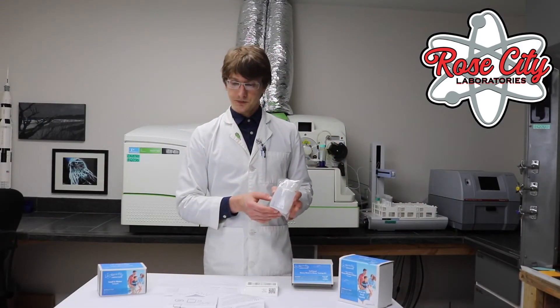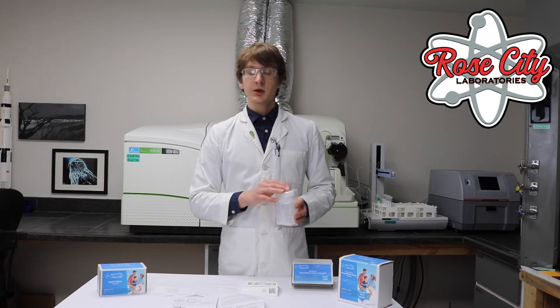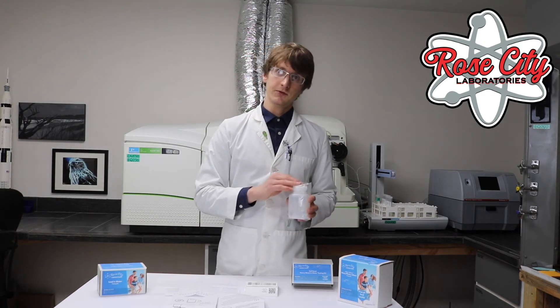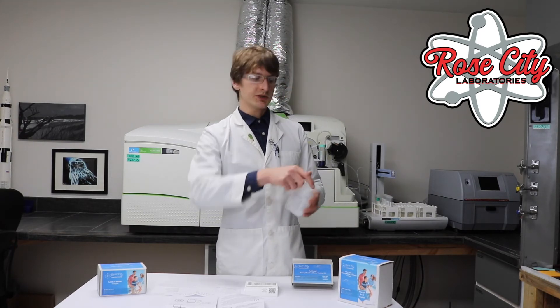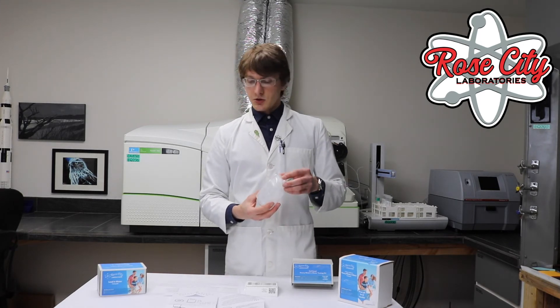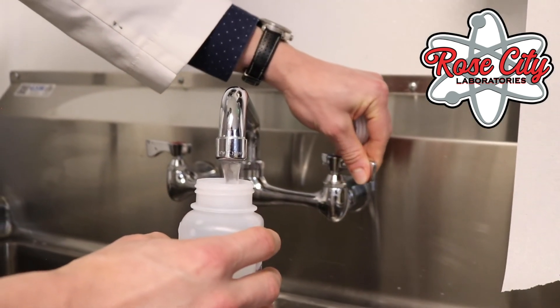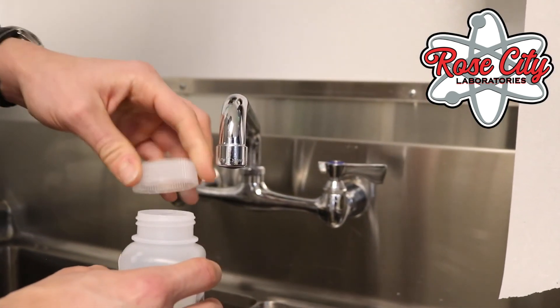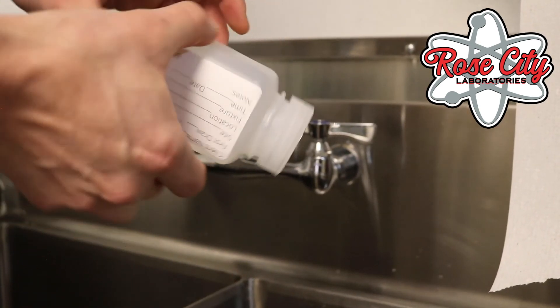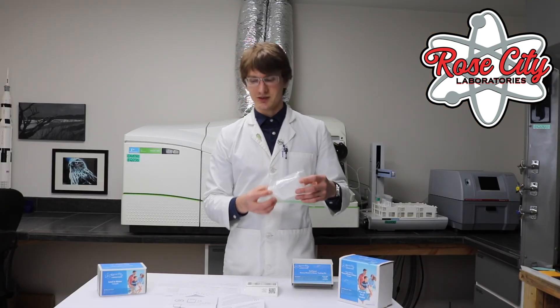In the kit, you'll find a sample bottle. What you want to do is fill this bottle all the way to the top. You want to make sure that there's not any air gap left in there if you are testing for mercury, because mercury can form a vapor which will escape when you open the bottle back at the laboratory. So the first step is to take the cap off, then fill with water from the tap until the bottle is completely full, put the cap back on, and then turn the bottle upside down to check to make sure that it is not leaking. You don't want it to leak in the package on the way back to the laboratory.